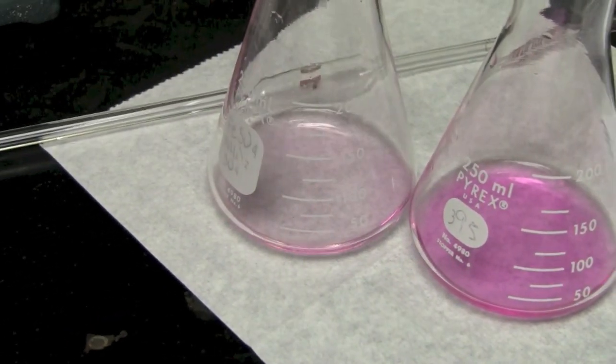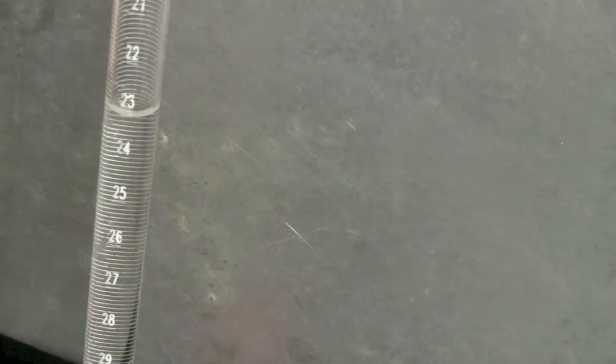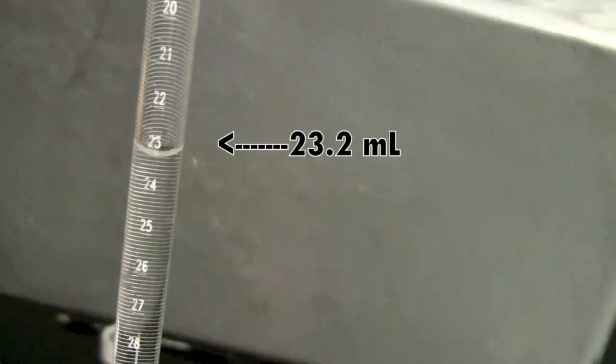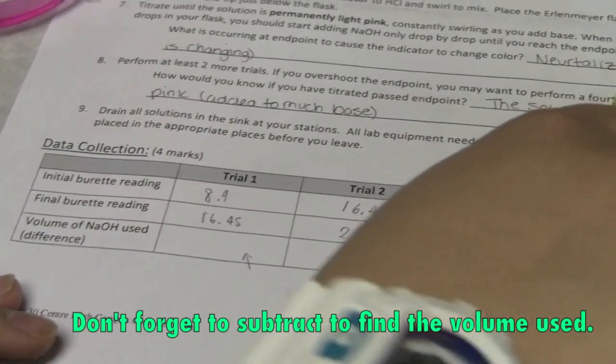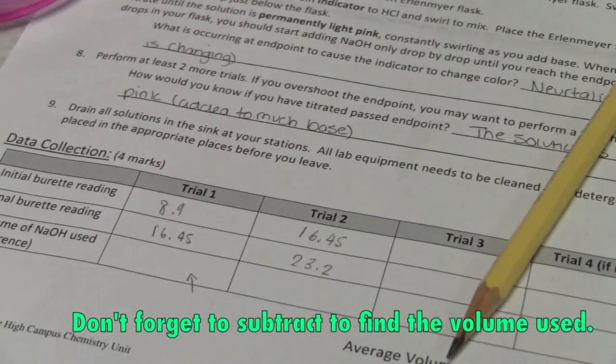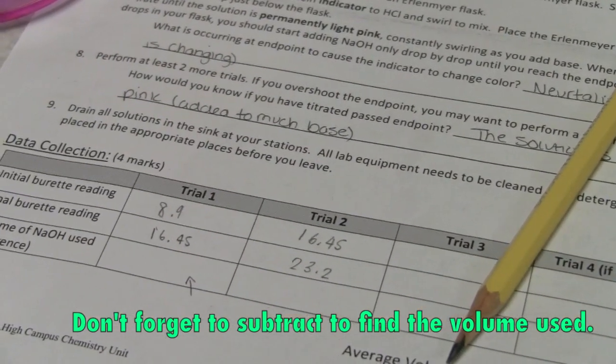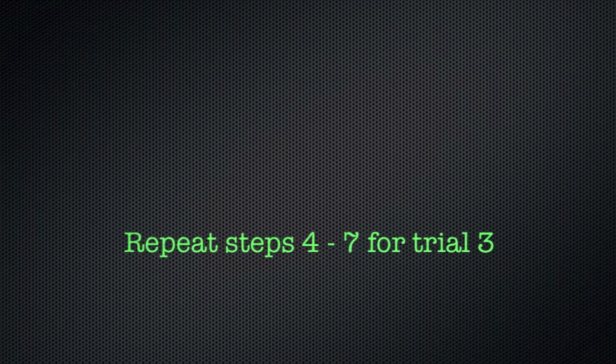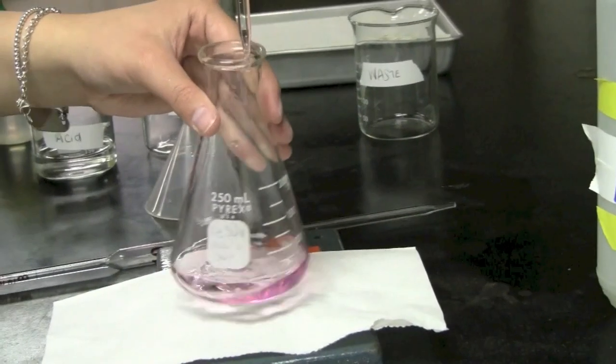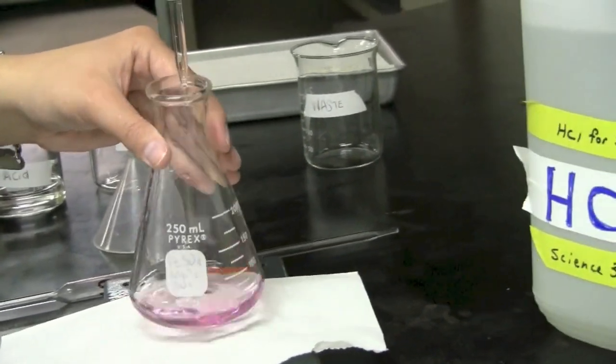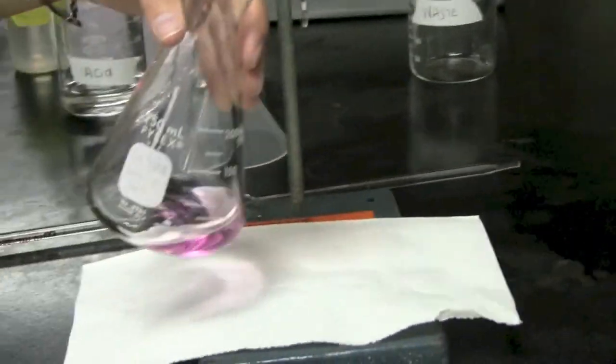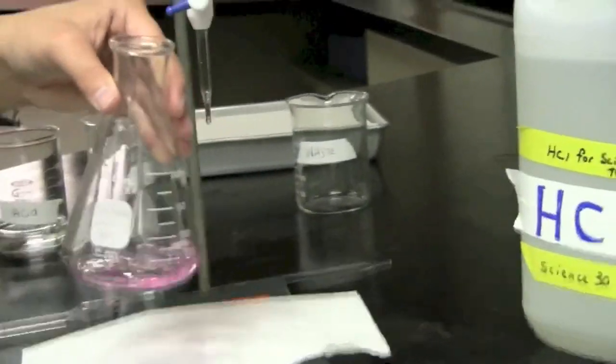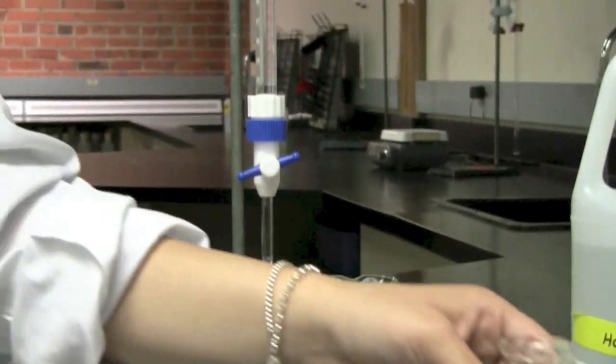So let's take a look at our burette measurement. So make sure you're at eye level when you're reading this. It's 23.2. You can see that it's already at a very light pink color and all we have to do is take the measurement of our burette. 29.9.